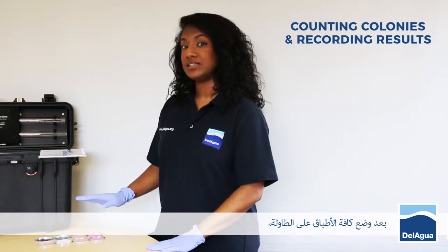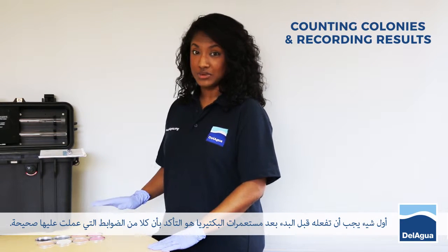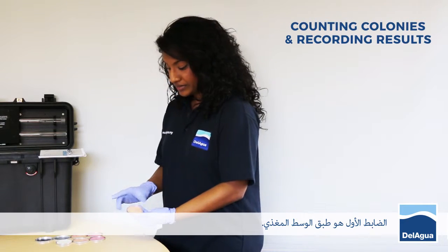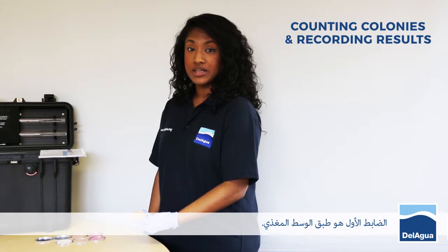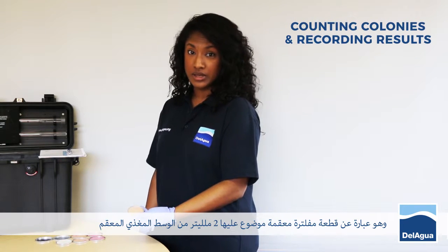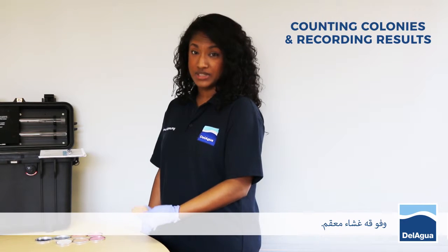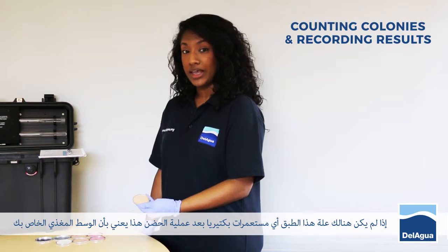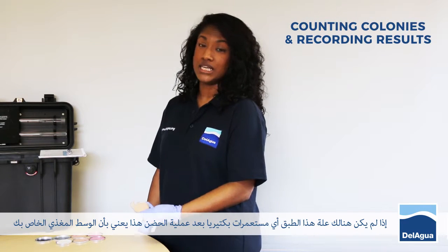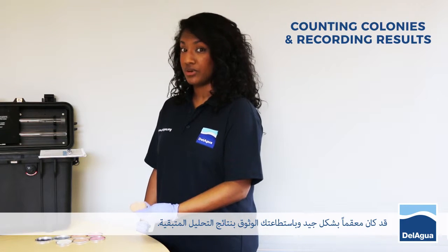Once your plates are all laid out on the table, the first thing to do before you actually start counting is to check your two controls have worked. The first control is the media plate control. This would be a sterile filter pad followed by 2ml of hopefully sterile media and then topped off with your sterile membrane. Following incubation, if this plate has got no colonies on, this means that your media was in fact sterilised correctly and you can trust the rest of your results.